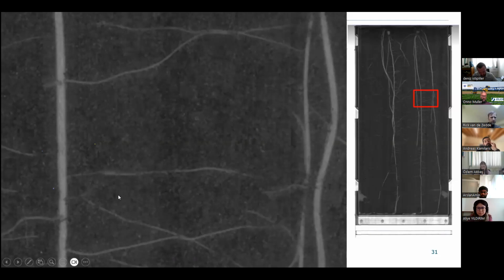And then already you can see that some parts of the root are hardly visible by the human eye, by your eye, and other parts are obvious. And the roots are really hiding once in a while. So they can even be gone for a few centimeters and then pop up again. And then we need to guess where it came from.